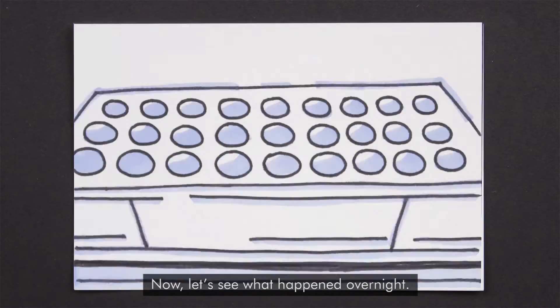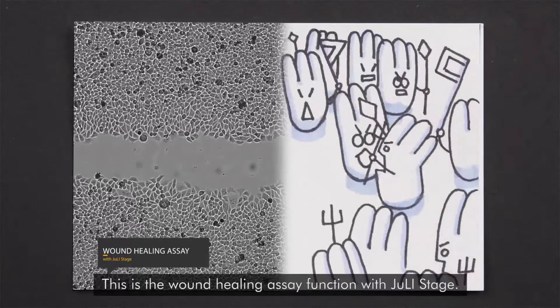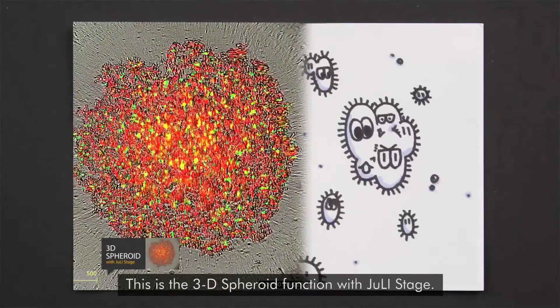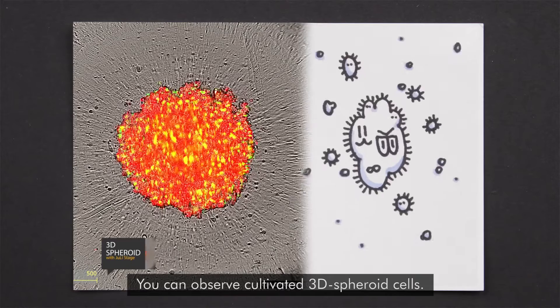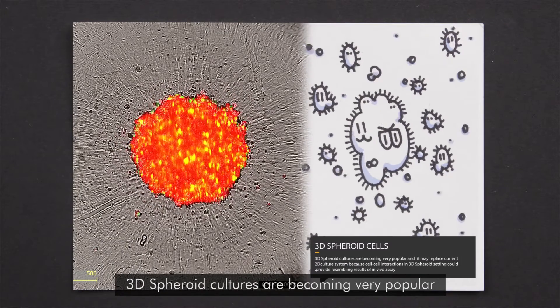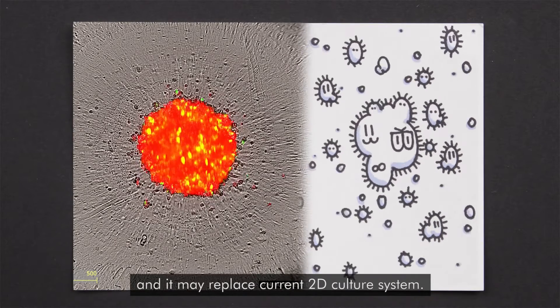Now, let's see what happened overnight. This is the wound healing assay function with Julie Stage. This is the 3D spheroid function with Julie Stage. You can observe cultivated 3D spheroid cells. 3D spheroid cultures are becoming very popular and it may replace current 2D culture systems.